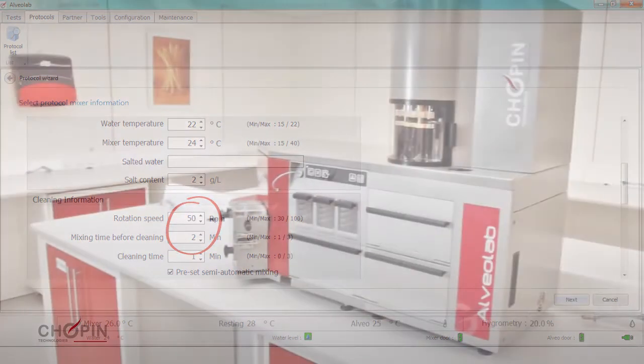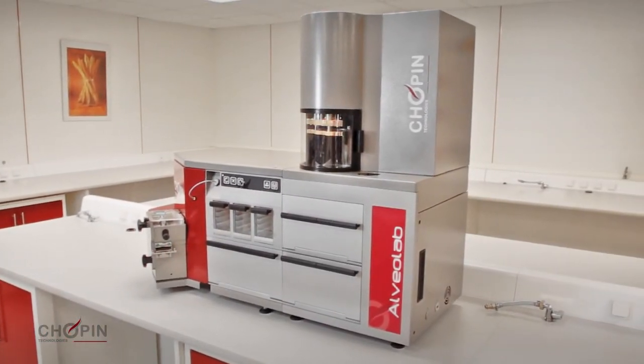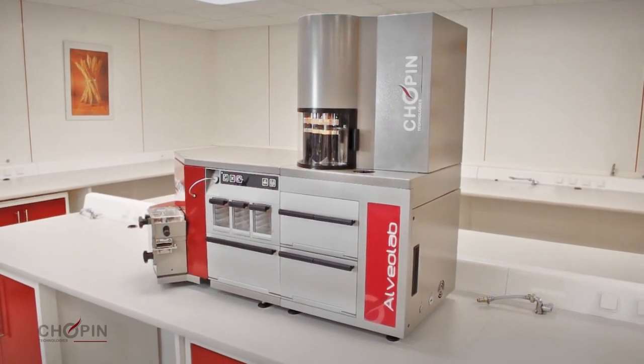Using the Alveolab, it's now possible to increase the number of tests carried out daily, thus optimizing the return on investment.